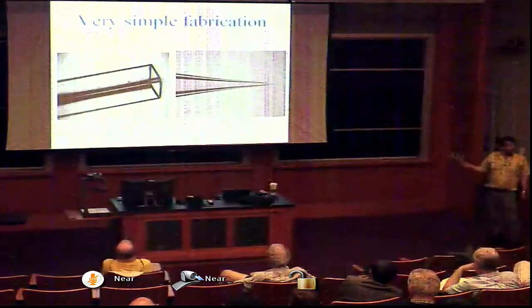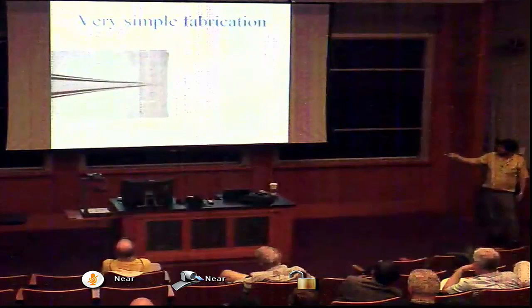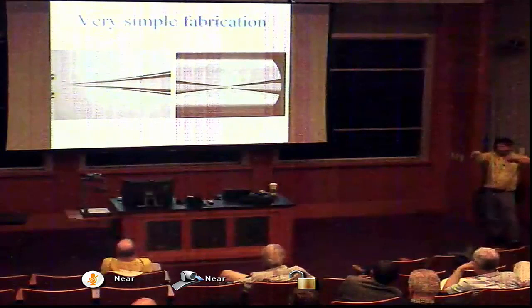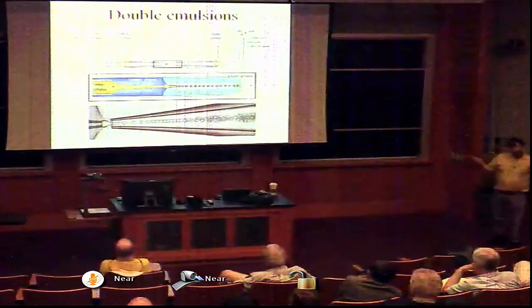So here's our square capillary. The first cylindrical capillary goes here. The second one goes threaded in the same way. It looks like this in the microscope. It's really easy to align these things. That's the beauty of being able to align this. You can put it all together and you can build a device. This is one of Andy's devices. He built it again in about half an hour.